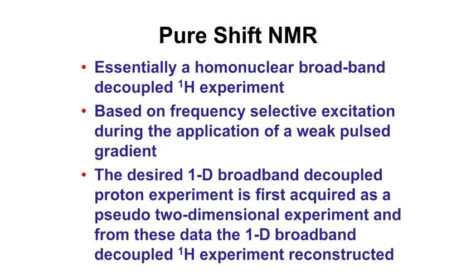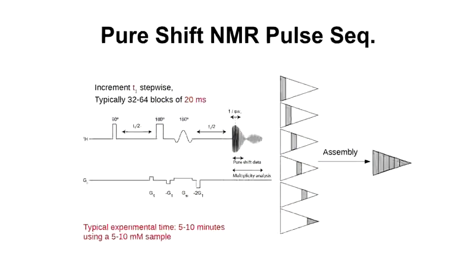So you can do lots of things with gradients. In essence, you're acquiring a 2D experiment, and I'll show you how, and reconstructing a broadband decoupled 1D experiment.